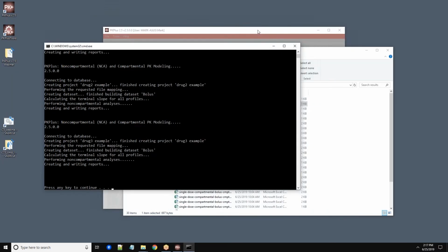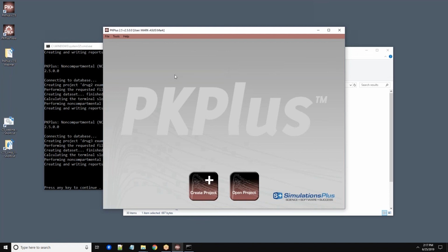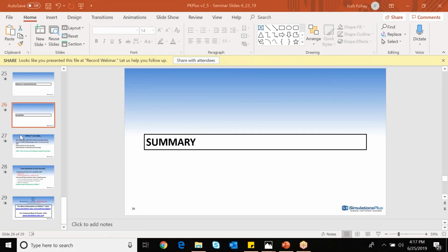So I hope I've covered enough of the new features in a way you're able to benefit from. And if you have any questions, please feel free to contact us. At that point, I'm going to turn it back over to Josh to go ahead and close out the demonstration. Thank you, Mark, for presenting the different options within PKPlus and the new functionality as well. I'm going to head back to my PowerPoint here and just finish with a quick summary.